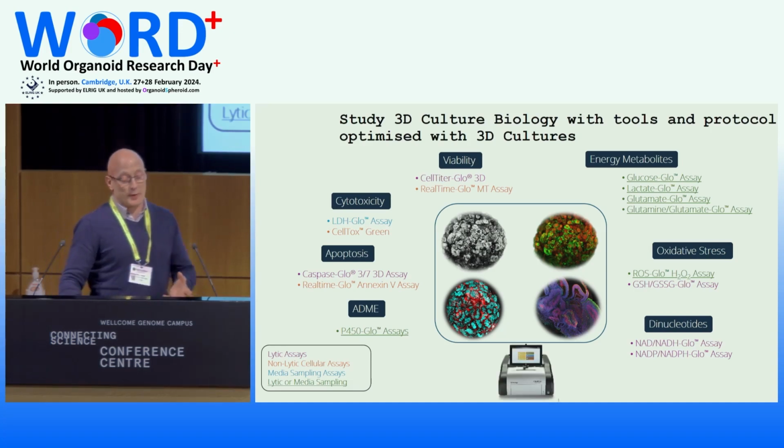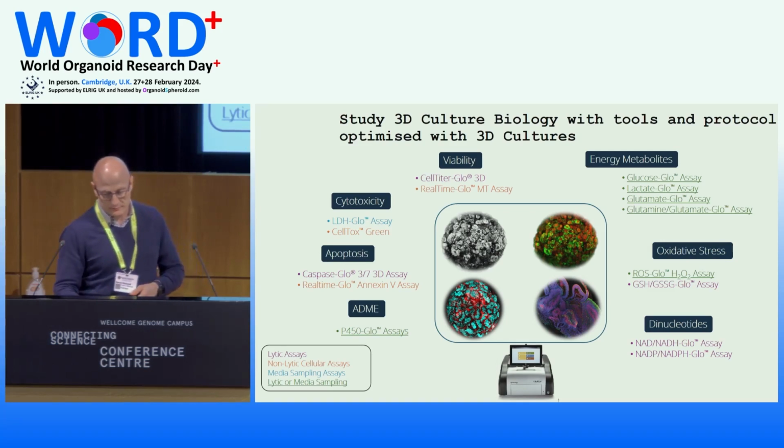But with all our cell-based assays, they can be used on a standard plate reader, as long as it has the capabilities of reading luminescence and fluorescence. So for the next few slides, I just want to go into a bit more detail on some of these assays.